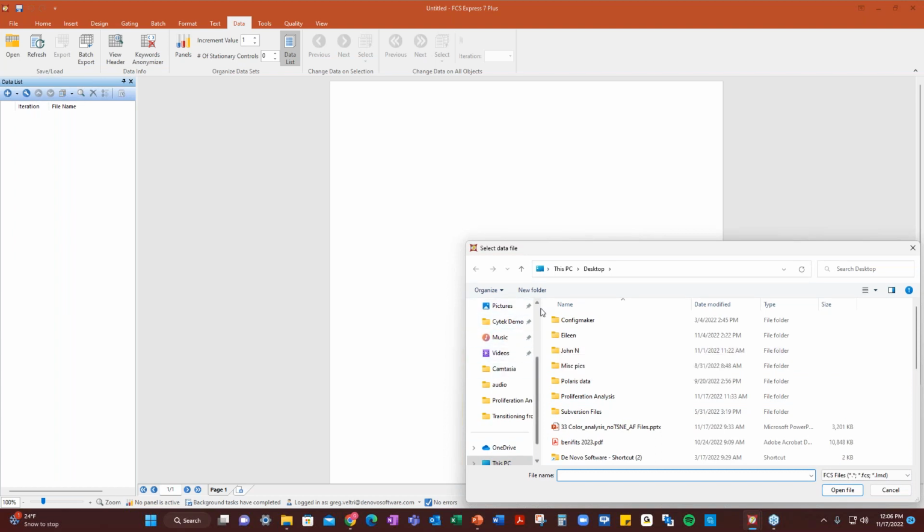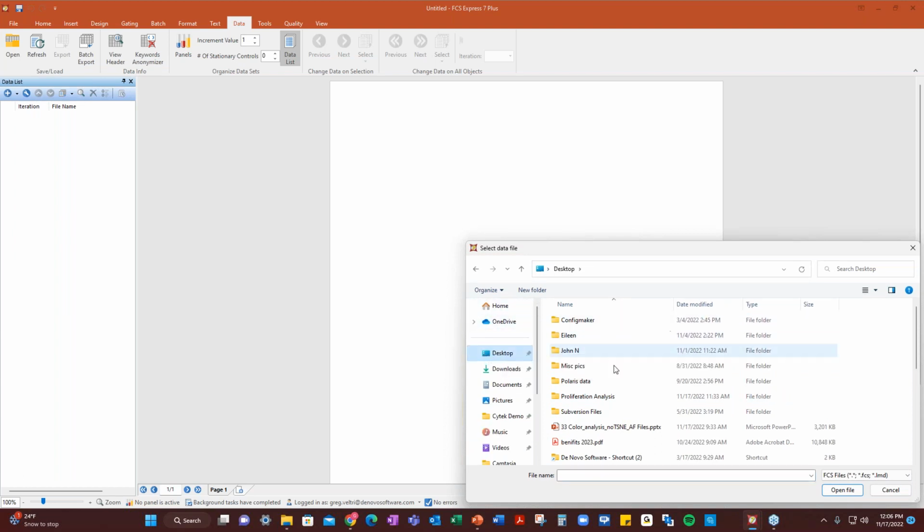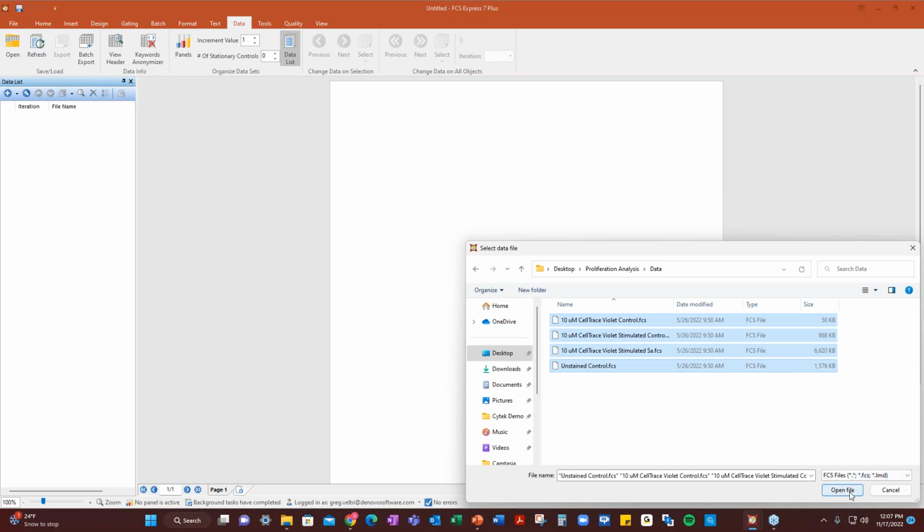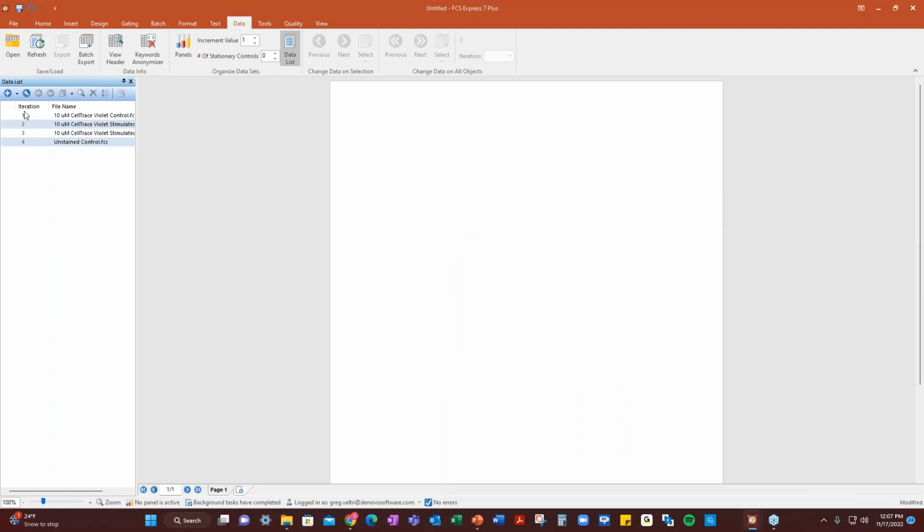So let's go to desktop. All right. And I have all of these, and I'm going to open those. And here's my data. Okay. And I could have dragged those in there too. There's different ways I can place the data there.